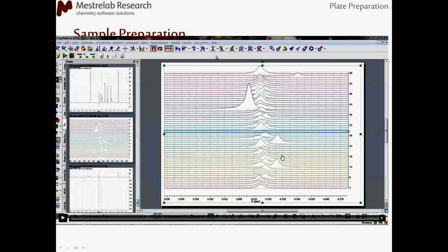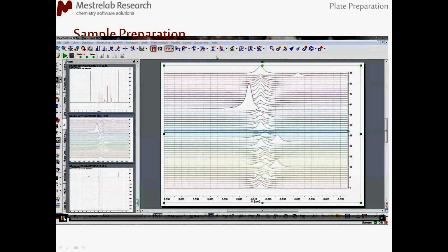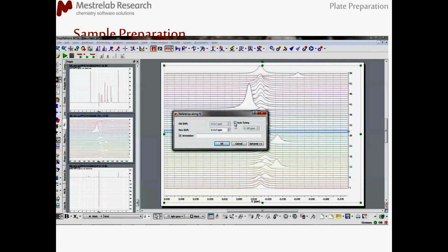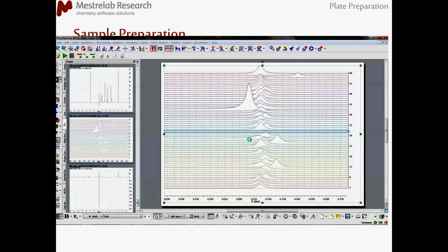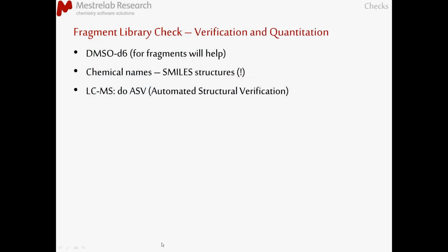So in that sense, what we want to achieve is getting from a starting situation like this, and many of you will have a spectrum like this. We are looking at our TSP region in this particular scenario, and what you will want to do is have that as aligned as possible. So with a few clicks, what we want to do is get from this scenario into a next scenario where we have an absolutely perfect alignment. And this, you will agree with me, is going to give us a much better starting point. Okay, there is always as well the point that should be raised.